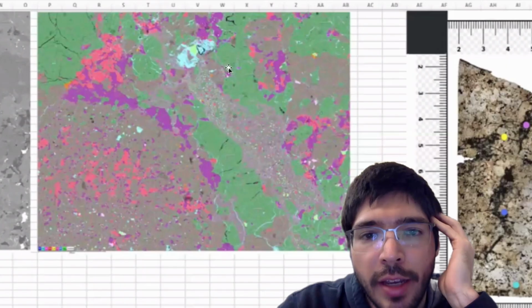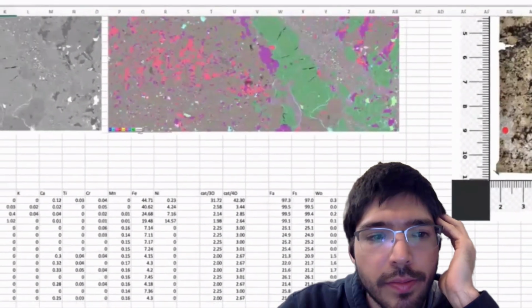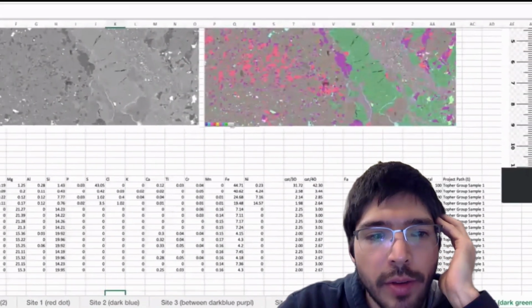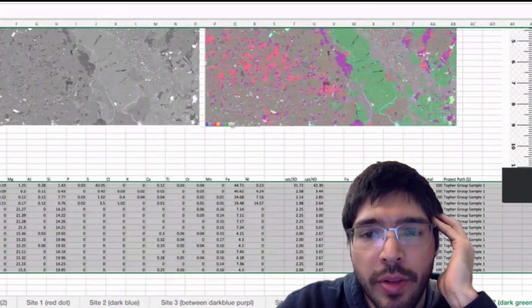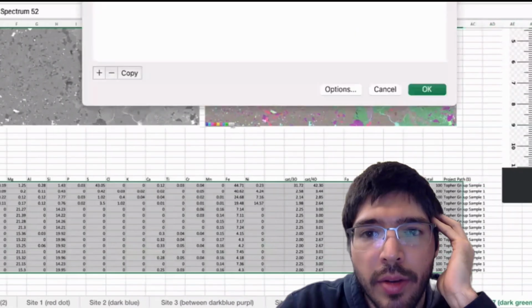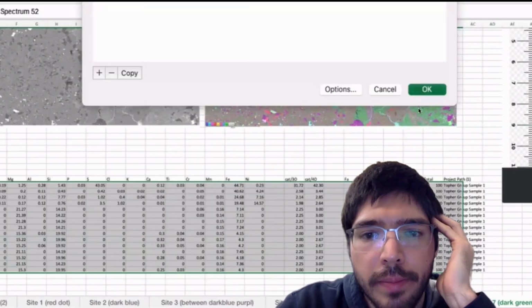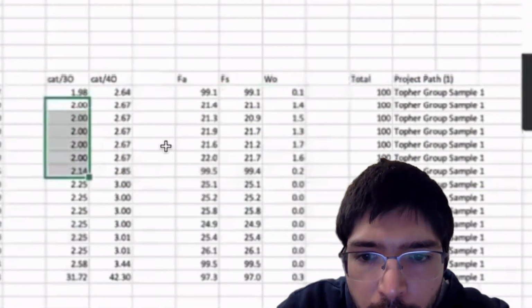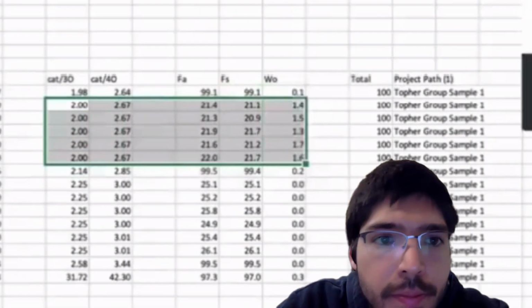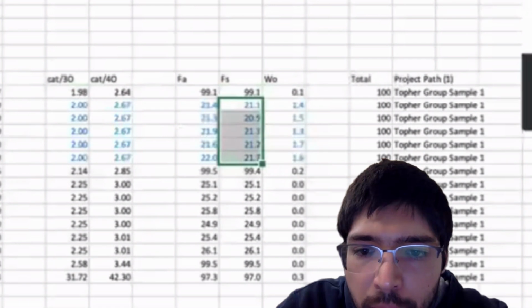And the olivine and the low calcium pyroxene are all the same color. And if I just check, one final time, whether or not they're the same composition everywhere else, that would tell us everything we need to know. So I'm going to sort and filter by the same column again. Okay. All right. And let's just take a look right here at these pyroxenes. And we can see that the ferrosilite is basically almost the same as everywhere else.